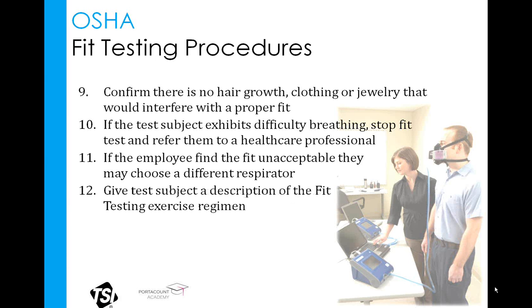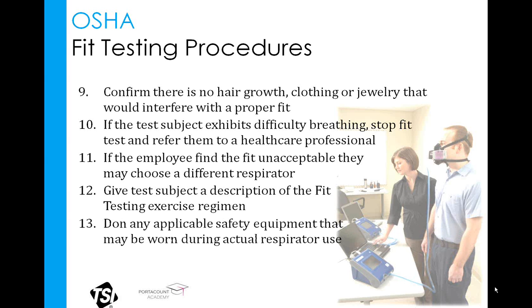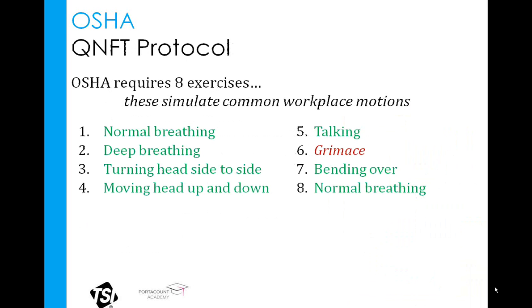Step 12 is your opportunity to explain the fit testing exercises that they're to perform, and we're going to go over these in just a minute. And then step 13 is where the employee will want to wear any work-related gear that could potentially affect the fit. For example, if they wear a hard hat or a helmet during their occupation, then they should be fit tested with that equipment in place. And then step 14 is the actual fit test.